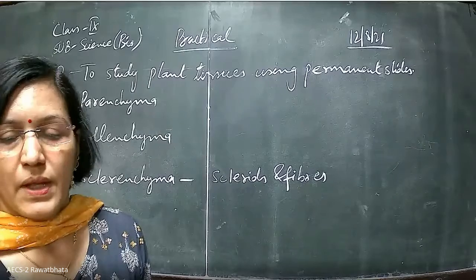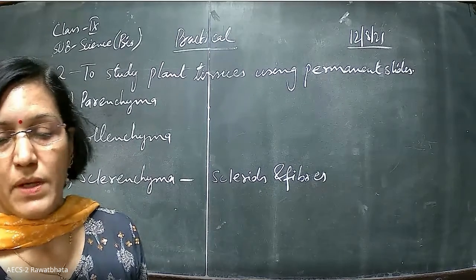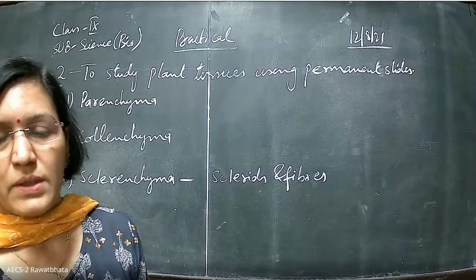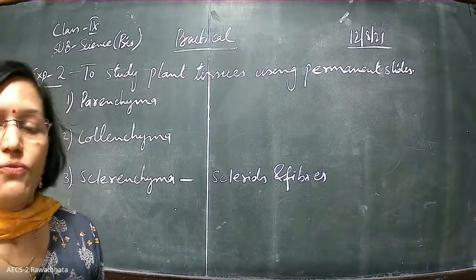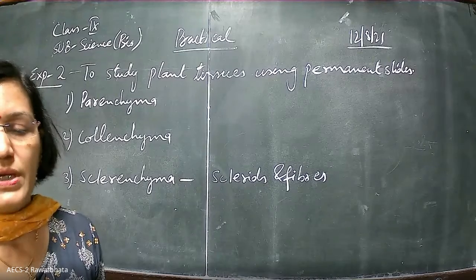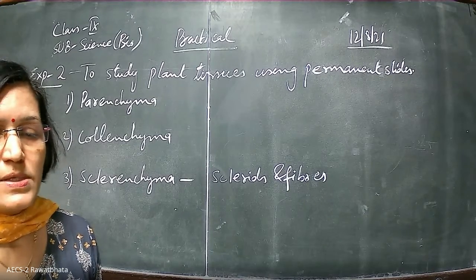And let's have a look at how this parenchyma slide is going to be visible to us under the microscope. Diagrams we have seen, but how this slide appears, for that, I have taken up certain pictures which make it very, very clear to all of us. And let's see.